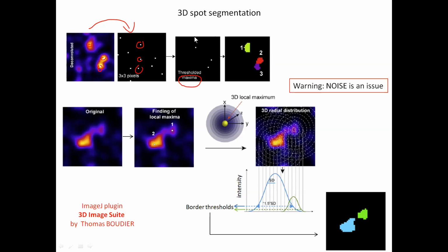So basically, to come back to the general point of this spot segmentation, the first step is that we will detect the maxima.